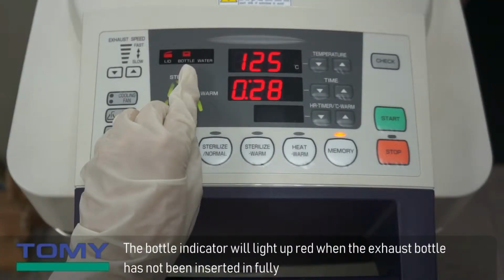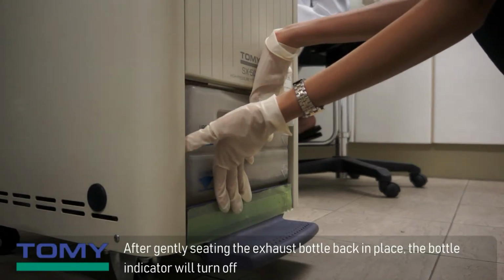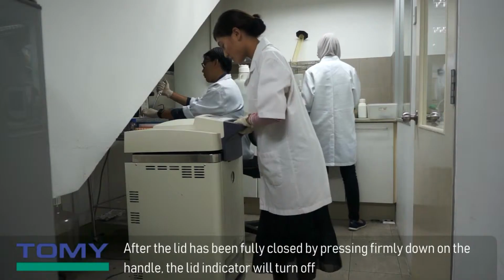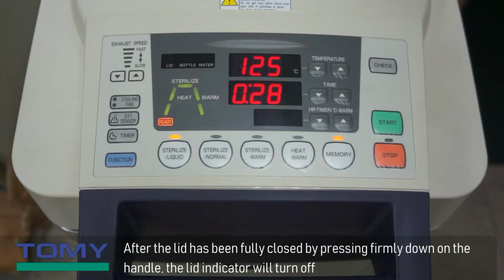The bottle indicator will light up red when the exhaust bottle has not been inserted in fully. After gently seating the exhaust bottle back in place, the bottle indicator will turn off. The lid indicator will light up red when the lid of the autoclave has not been fully closed. After the lid has been fully closed by pressing firmly down on the handle, the lid indicator will turn off.